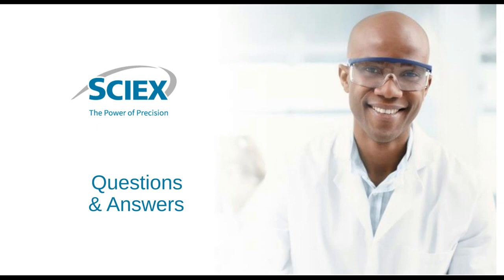Our next question from an audience member: how is the separation efficiency, the resolution, of CE-SDS compared to SDS page? And also, can you comment on the sensitivity comparison of these two techniques?